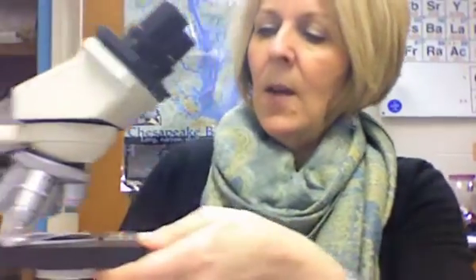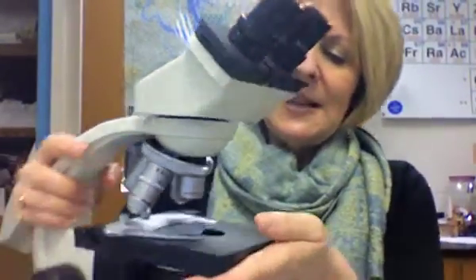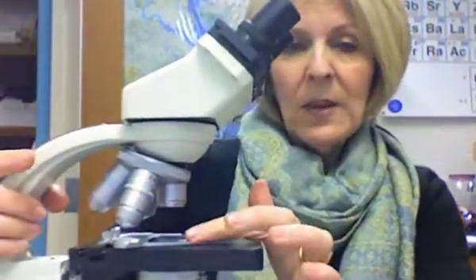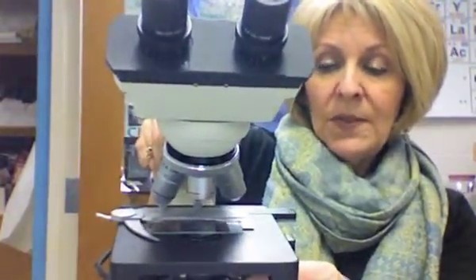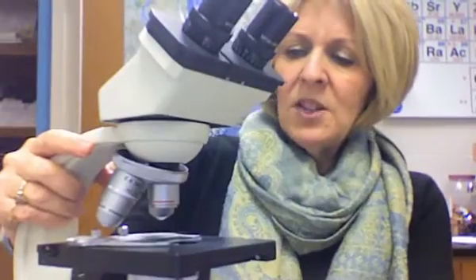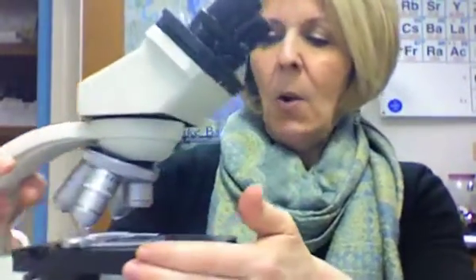Now with your specimen on the slide, you're going to place it in the clip on the mechanical stage like this. The mechanical stage has a little knob that moves the stage left and right and up and down, so you can position your specimen right over the hole where the light comes through. Notice that in all these steps so far, I haven't looked through the microscope yet — and that's important. Now rotate the objective to the lowest power.